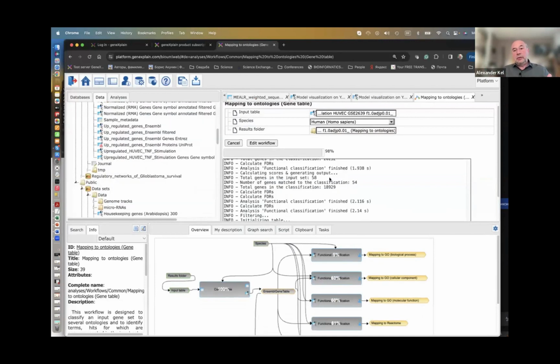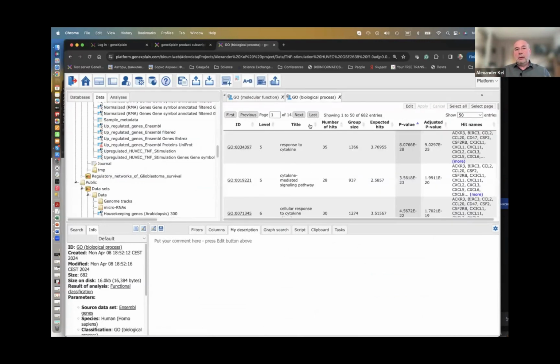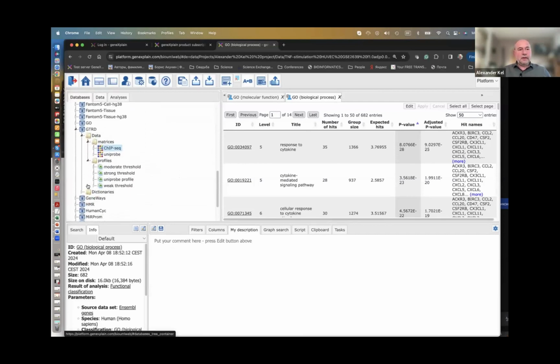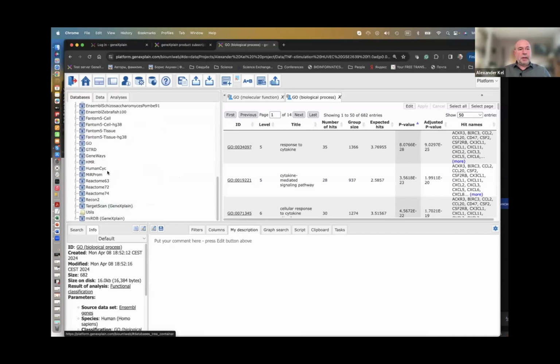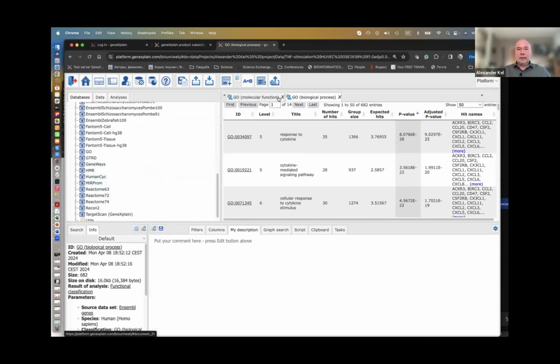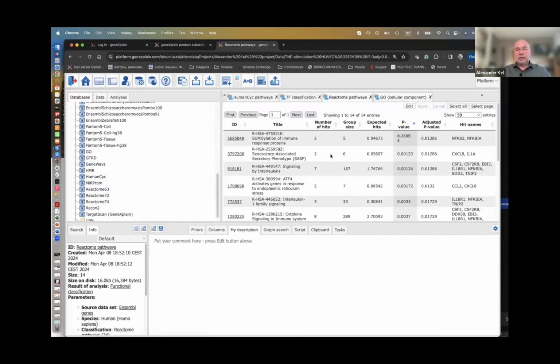of ontologies, including pathways. And pathways it takes from Reactome as a free database. So we have here several databases available for you to map, and these are Reactome and also HumanCyc. Then in the results of Reactome pathway analysis, you see, yes, right, Neetu was showing it as well. So those are the Reactome pathways shown to be enriched.